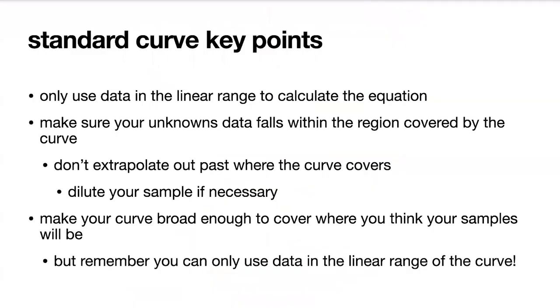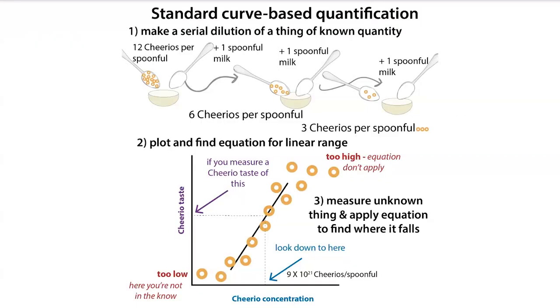So dilute your sample as necessary in order to get your sample to a place where it's actually on the line. Don't extrapolate past the beginning or the end of the line because you might not be in the actual range covered by the curve equation anymore. You could, say, be in one of those curvy regions where the data is not going to apply. Your equation is not going to apply. So, hope that helped you understand standard curves.